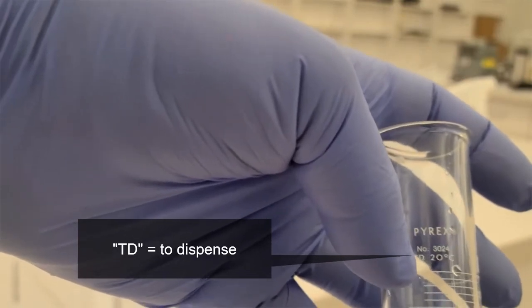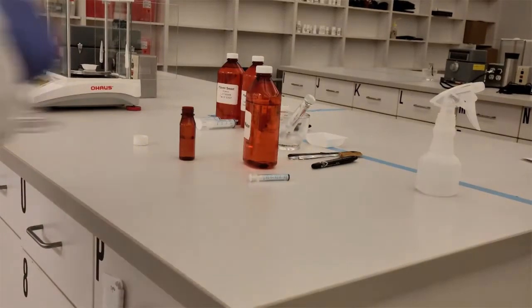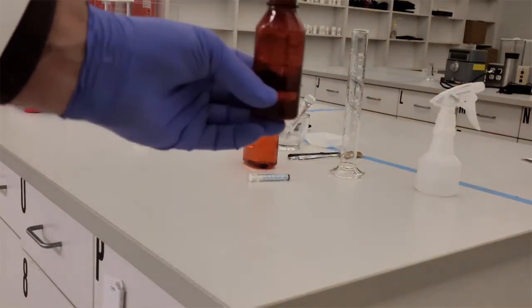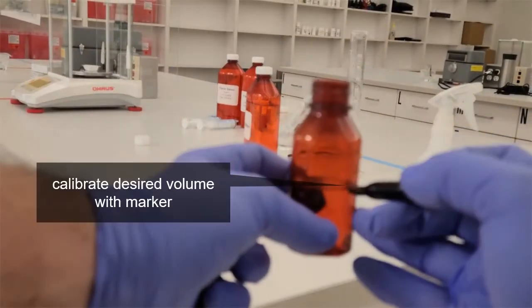Well, this says TD on it, which means to dispense. So those little amounts of water are part of the calibration of the graduated cylinder. So I know I dispensed 35 mLs, and it accounts for that water.